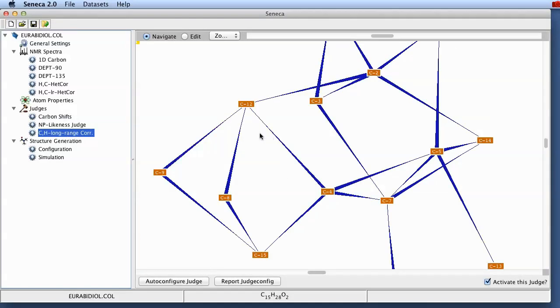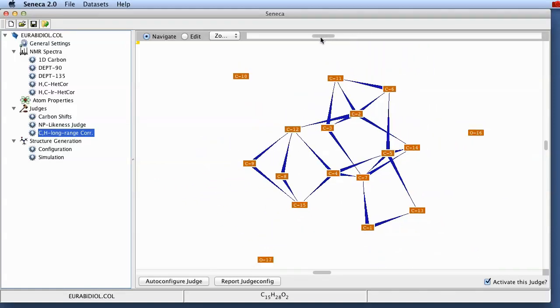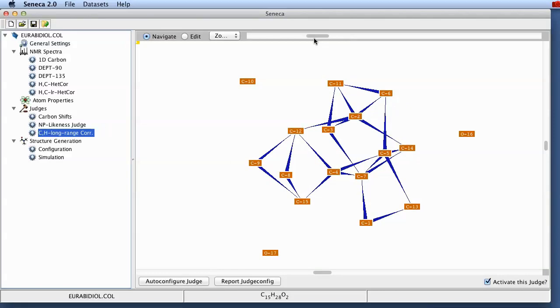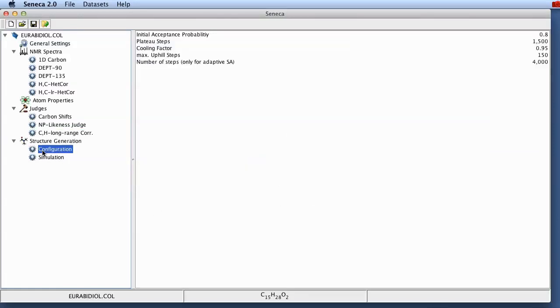And what is actually important is the carbon long range judge which will check if the CH long range correlations are in agreement with the structure that we are currently investigating. This graph here actually shows you all the correlations between the different carbon atoms which have been determined from the carbon hydrogen long range correlation.